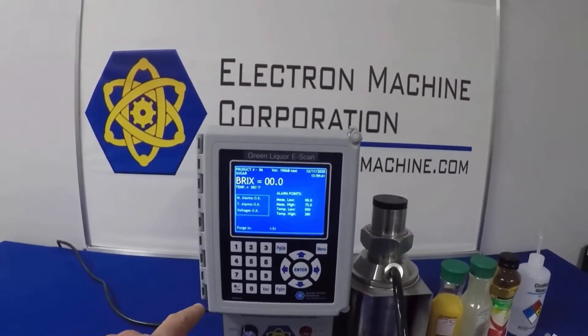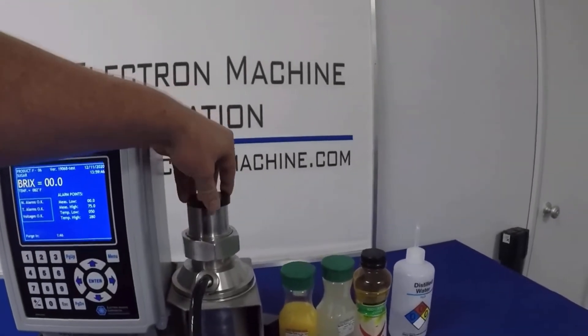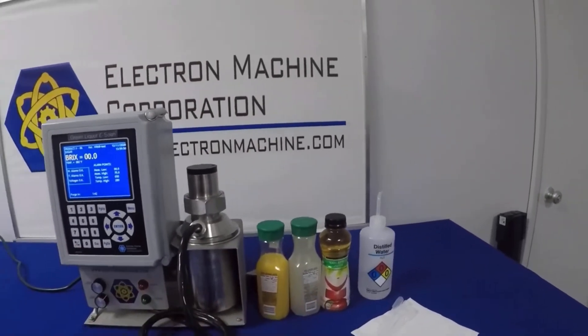We have our MPRE scan set up on demonstration equipment. This is usually installed in a pipeline. Today I have a static cup on it and a variety of juices here to measure.